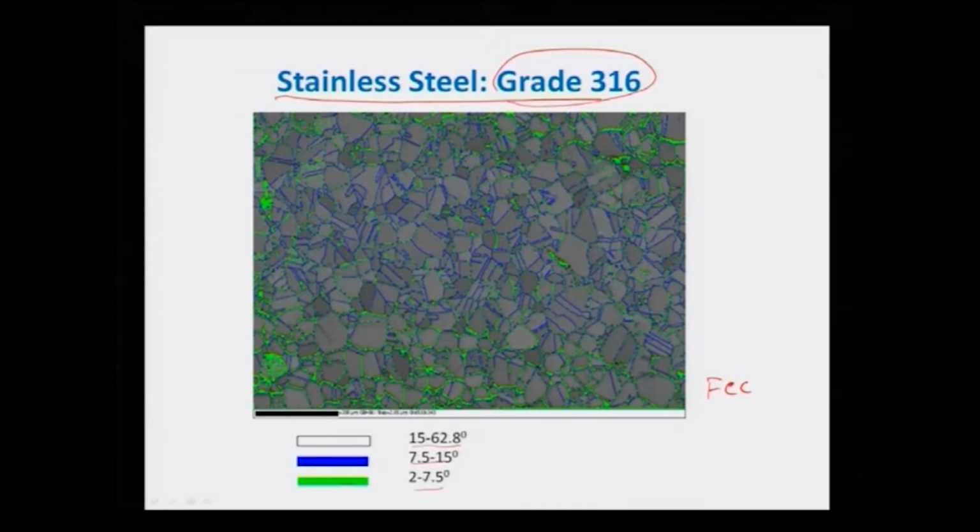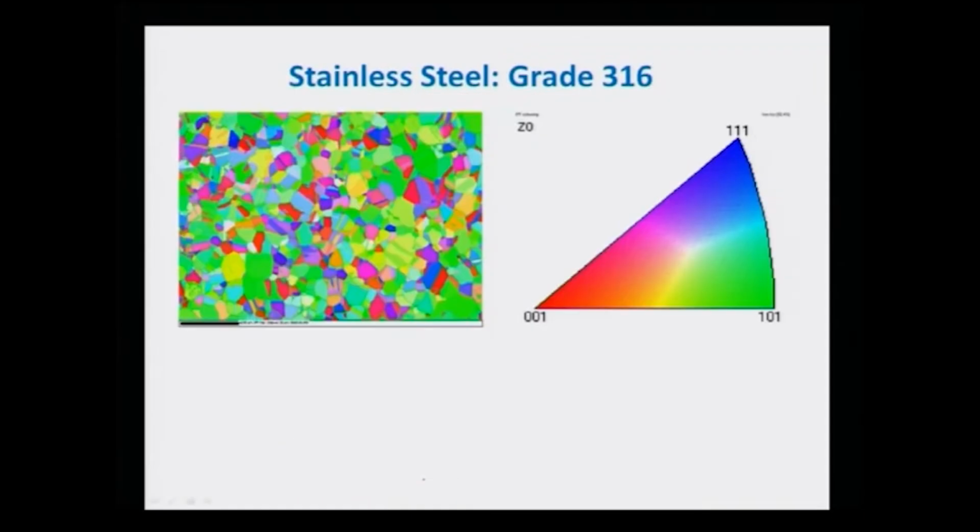First of all, there is a certain kind of grain refinement that happened because of the recrystallization or whatever happened in the rolling process. Now, one can actually produce this grain map from the EBSD data, and that is what is shown here. You can see the grain map very clearly. One can even see the twins and stacking faults in stainless steel. This is one, there is another one, there is another one, a lot of them.